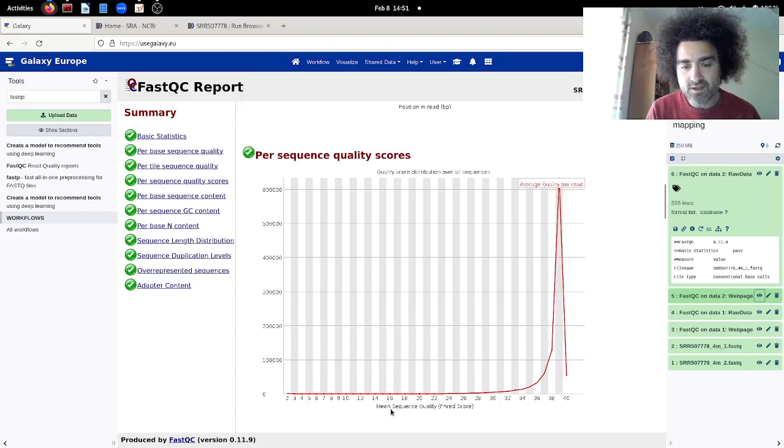So we get a sequence, we get the quality scores for every base pair on this sequence, on every read. So we have 36 base pairs on a read. We find the average of quality scores for these 36 base pairs, and this average is one value. And then we do the same for all reads. So we have 1 million average quality scores, just because we started with 1 million reads. And the distribution of these mean quality scores for all these 1 million reads is shown here.